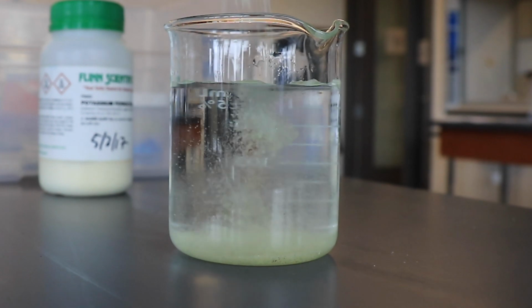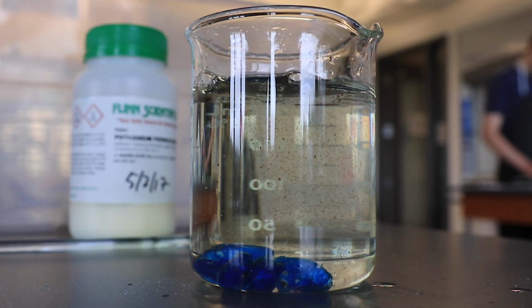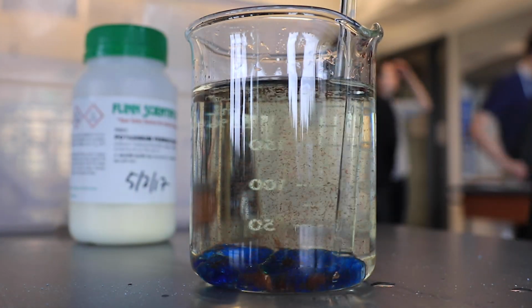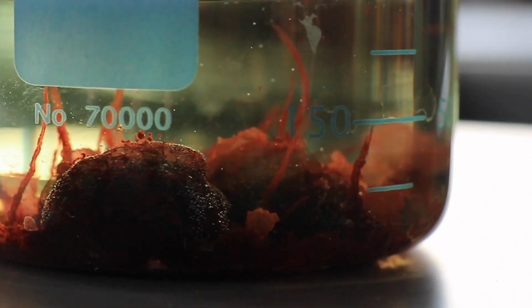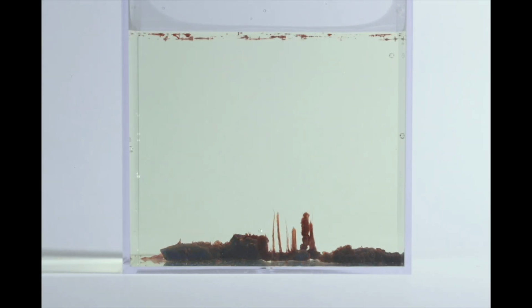Let's watch it again! Here we're mixing the potassium ferrocyanide in the water to make this solution. Now we're dropping in the cupric sulfate crystals, and you can tell that the reaction has already started. Over the course of the reaction, the spires will slowly form, but it takes a long time.